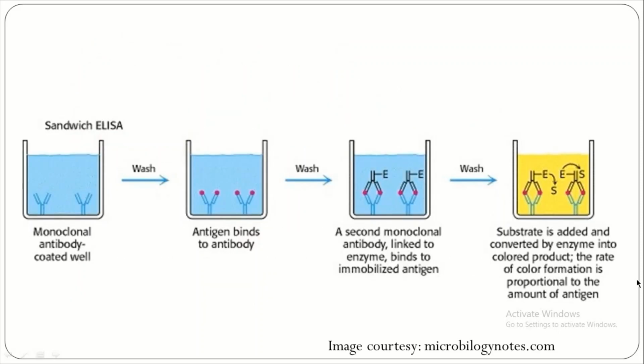So in this picture, we mention it carefully, right? This is a pictorial representation of sandwich ELISA. This is the simplest way. I can tell you another way how people are doing it. Our commercial kits follow the method which I am going to tell you a little later. So first we will see the sandwich ELISA.